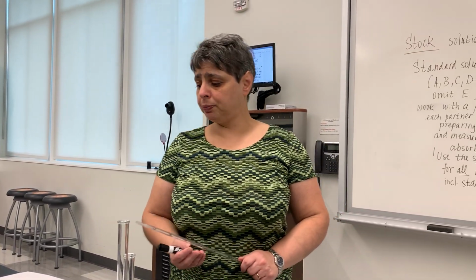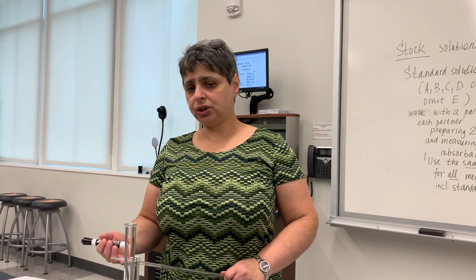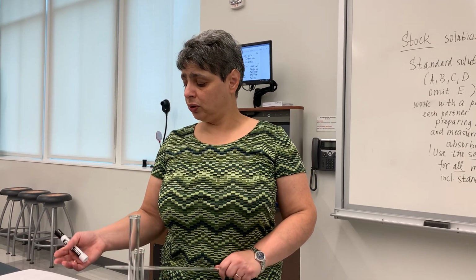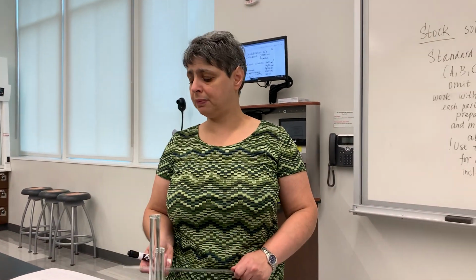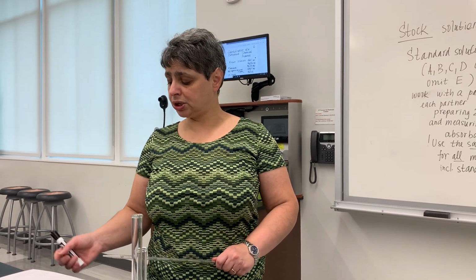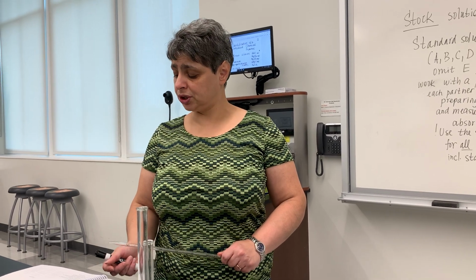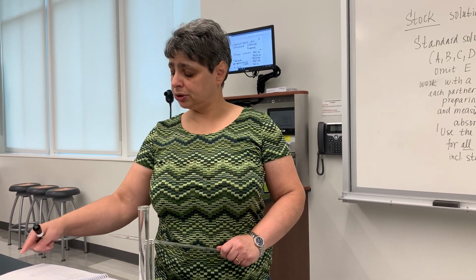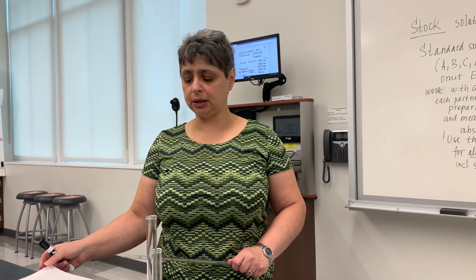So your report for this experiment will consist of data sheet 1 and data sheet 2. You'll have only 2 determinations for data sheet 2 because each of the 2 partners will be able to do only 1 run, or 1 determination, and then once again you will share data with each other on that. And so a 3rd determination on data sheet 2 is not needed.